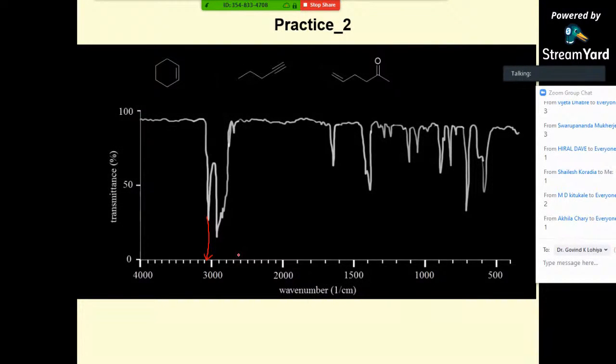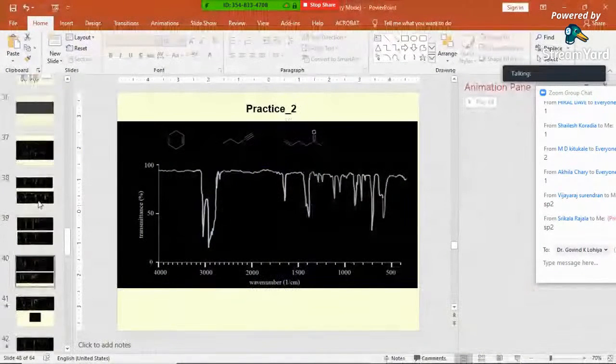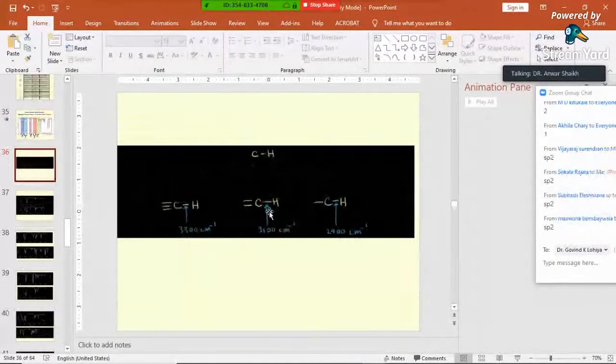Yes, very good. It is sp2. At the beginning, I told you it will be 3100, and it is sp2. I will come back.